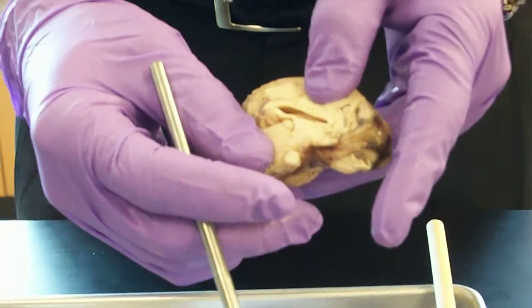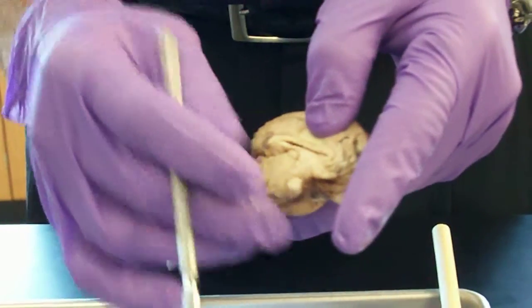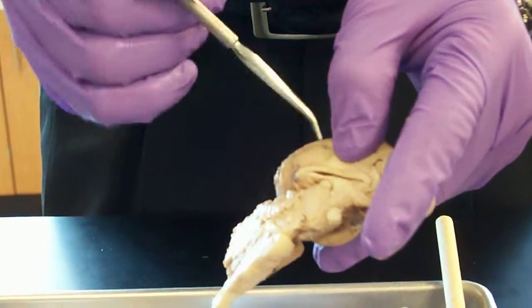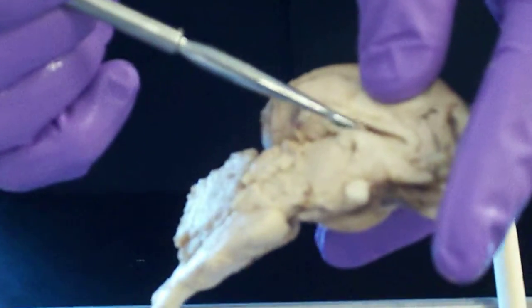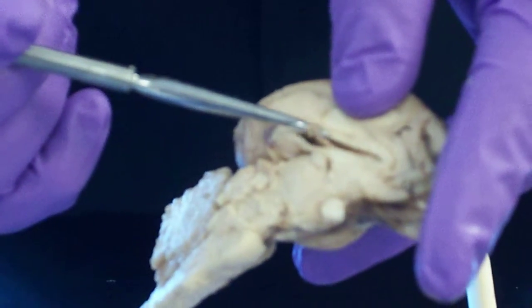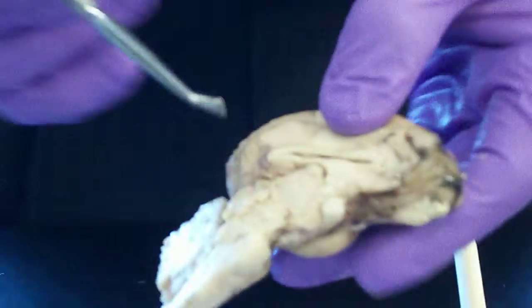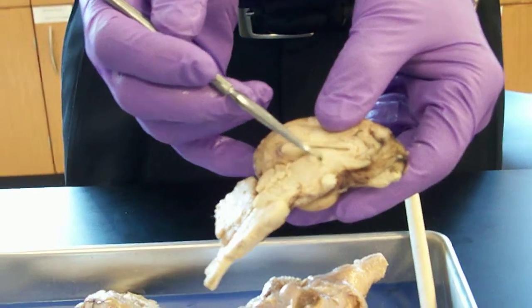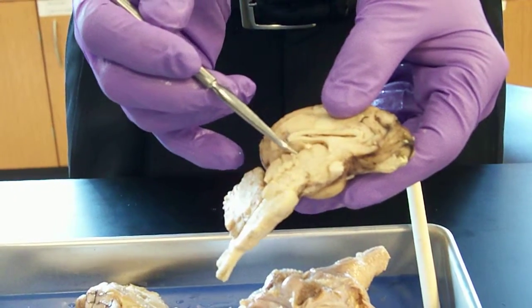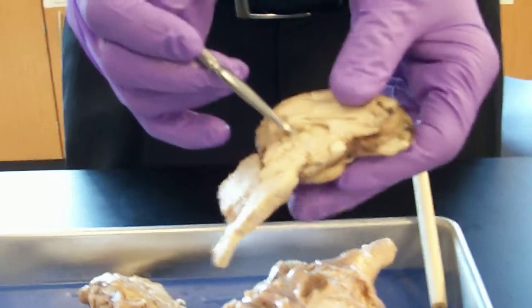That space in a real, live brain would be filled with cerebrospinal fluid. What pumps out that fluid, if you can see it in there, is that little structure right there, the choroid plexus. That choroid plexus fills this lateral ventricle with fluid. Right beneath that, we can see the thalamus. The thalamus has a little scooped out region around it. This is the 3rd ventricle. And there's a choroid plexus here that fills the 3rd ventricle with fluid.